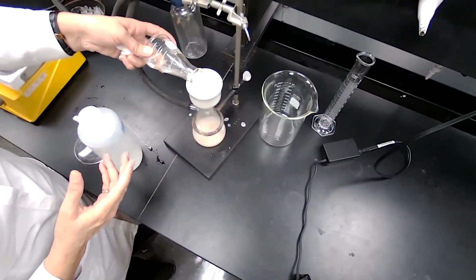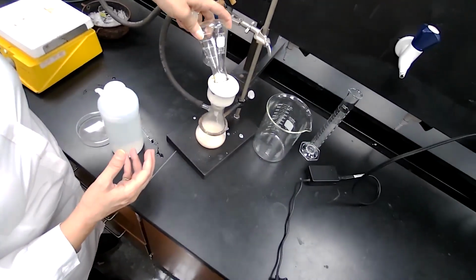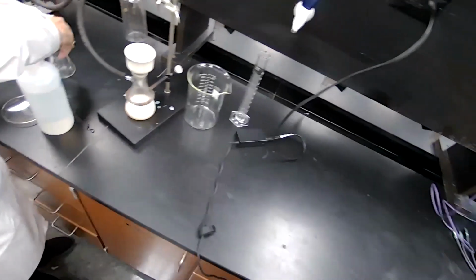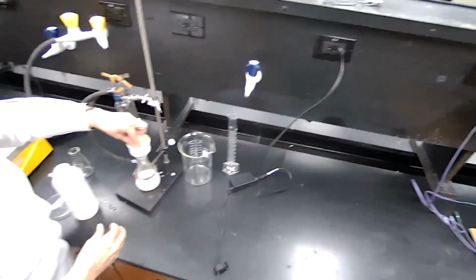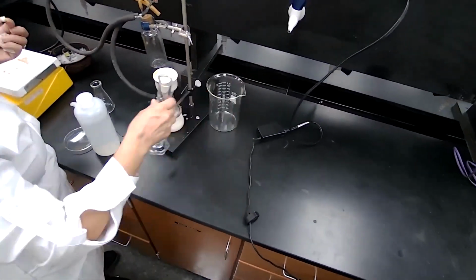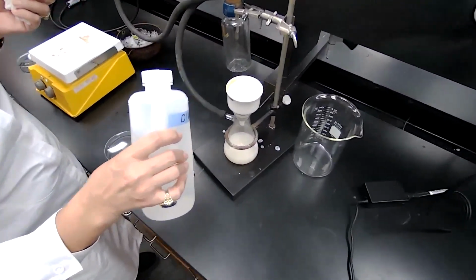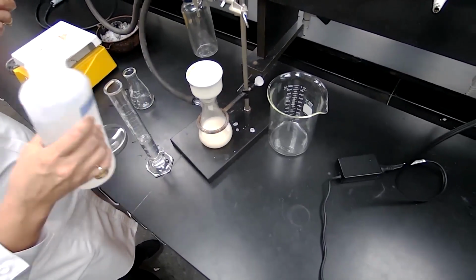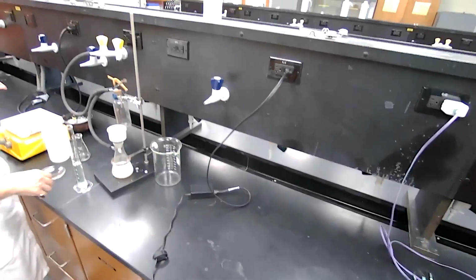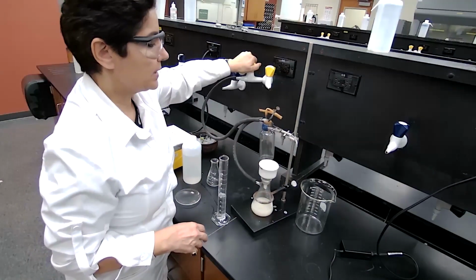Washing this precipitate is going to be challenging. It's going to take some time, and we are just going to continue washing with water. 3-4 times we are going to wash this with water. Each time we're going to measure about 50 milliliters of water, and proper technique for washing would be to turn off the vacuum.